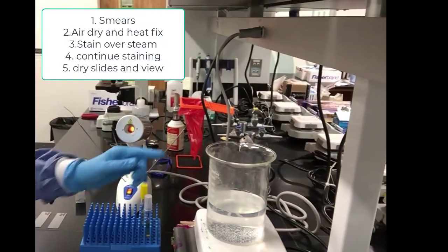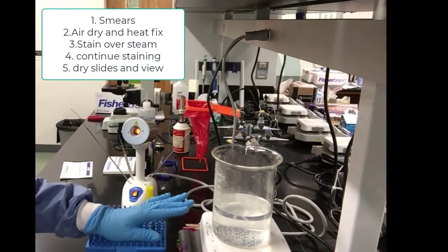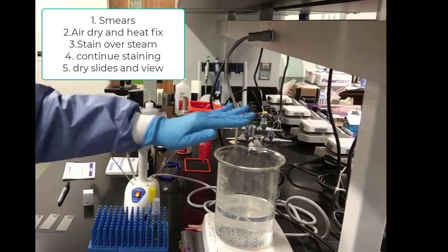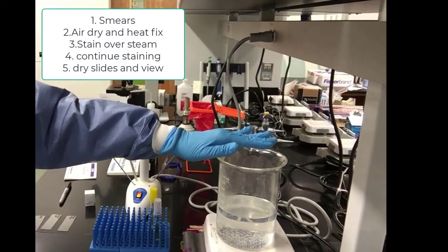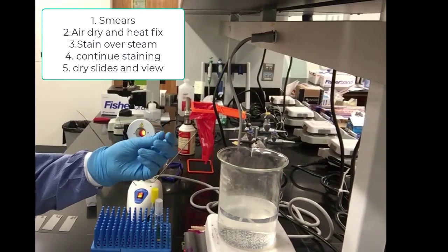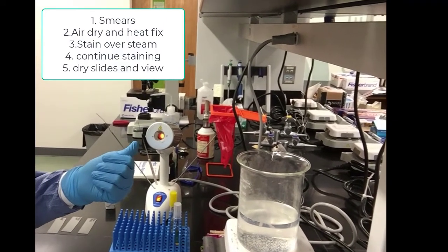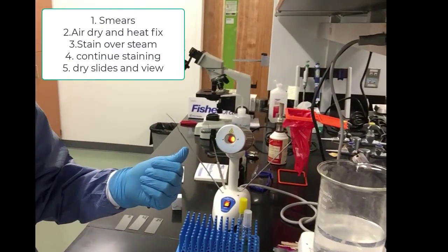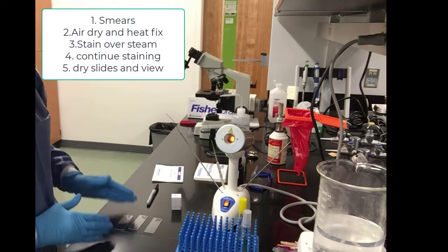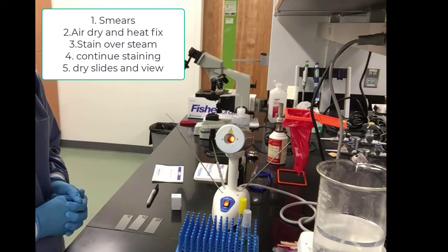So the first thing we're going to do is do our smears, air dry, heat fix next, stain over the steam. You can see the steam here. There's some steaming water on a hot plate. We want to be careful not to touch the hot plate or have the cord entangled anywhere or close to anything that can burn the cord. So we want to make sure we stain over the steam. This is the heat method for the Acid-Fast staining procedure. We will continue staining and dry our slides and then view them under the microscope.